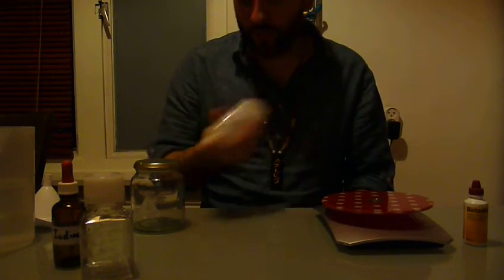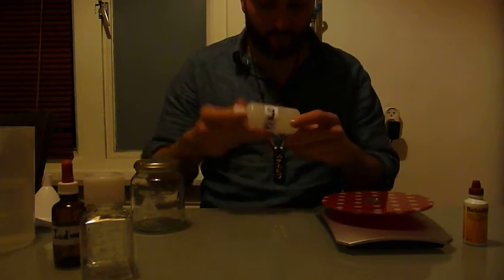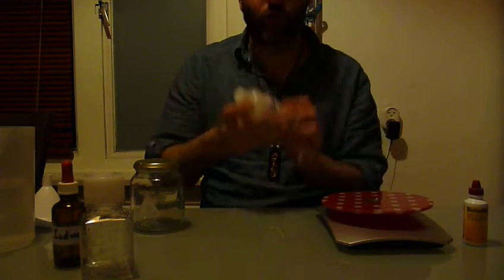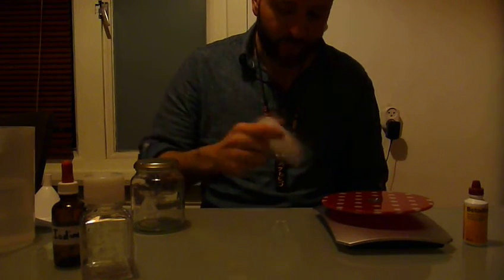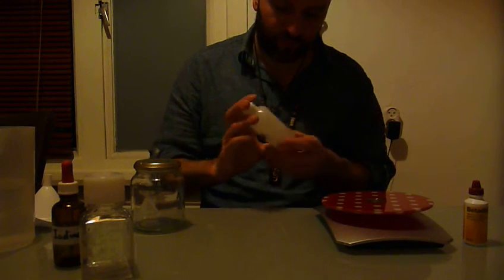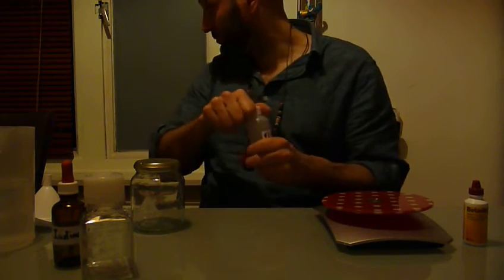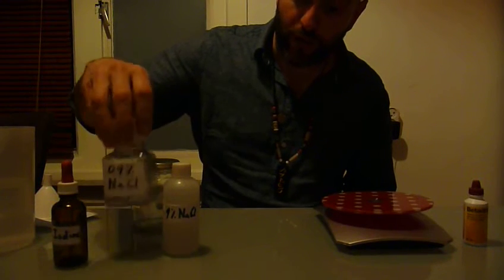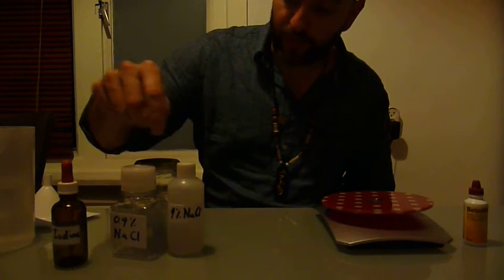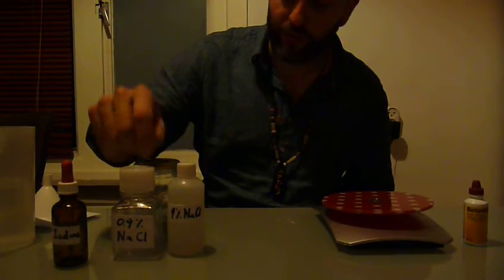Shake it a bit to dissolve — it should dissolve fairly quickly. Good. So what we want to do now is dilute this 10 times, so we end up going from 9% to 0.9%.